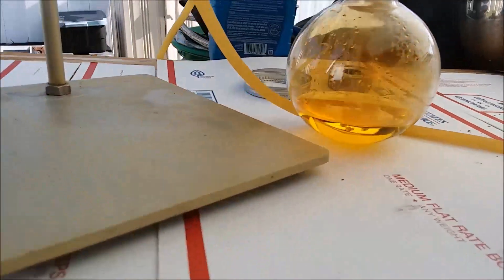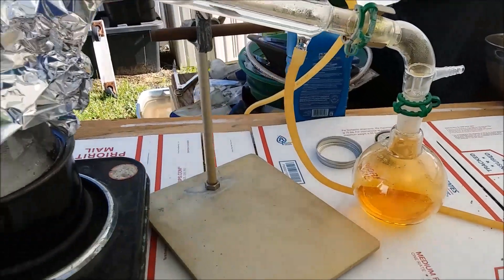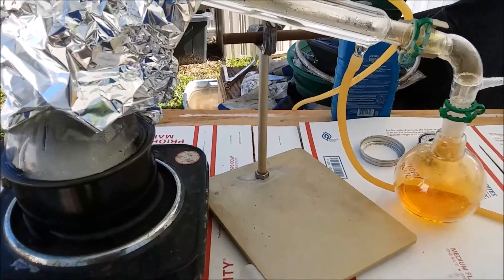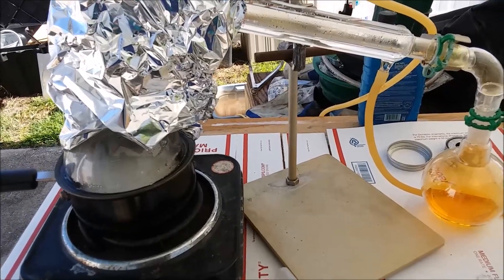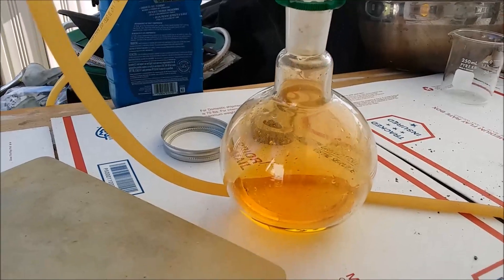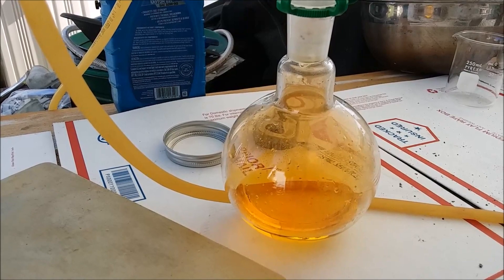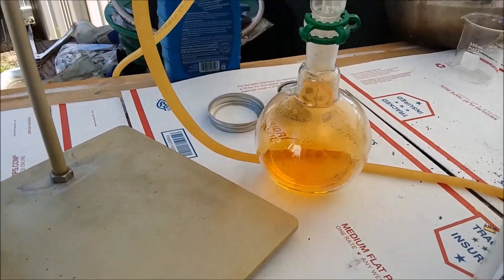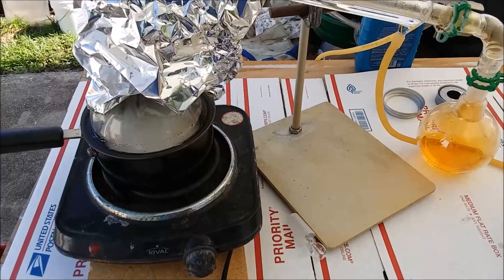I think I've definitely got a better yield this time than last time. I'll measure it once I shut this down. I'm getting close to ready to call it and shut it down so it can start cooling off. The drops aren't coming that frequently anymore. So it's taking a while, but I definitely got something right.